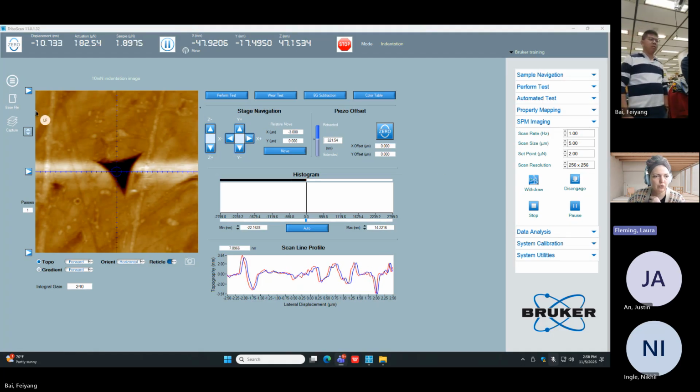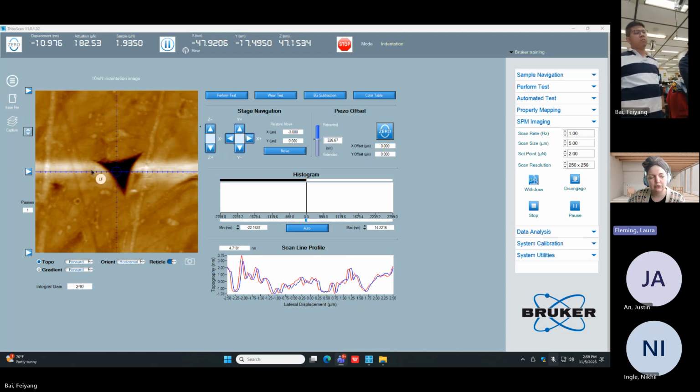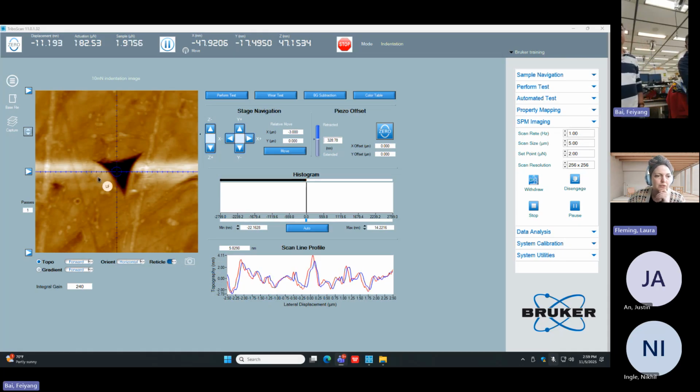Okay. Yeah, so it's scanning line by line here. And when it scans here, this surface is all at relatively a similar height. There's maybe a couple nanometers, maybe not even, of tilt that we have corrected for with the background subtraction. So that means when it takes the average, they're all at relatively the same height. Versus on this line, or the lines around it, if we draw a straight line across, on that pass, these are two now very different heights. So that makes this look artificially high, because the average is somewhere in between the two of them.